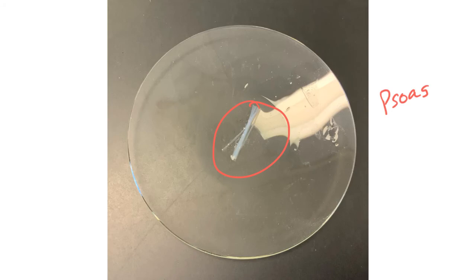What you would have done is we would have given you 2 teasing needles, which are basically 2 glass, very fine tip probes, and you would have brought those together and pulled this muscle apart to get individual fibers if possible. Now you can't see individual fibrils, but as small as possible. So you would have teased those apart. This is probably the longest part of the lab that you missed, trying to dissect this apart.